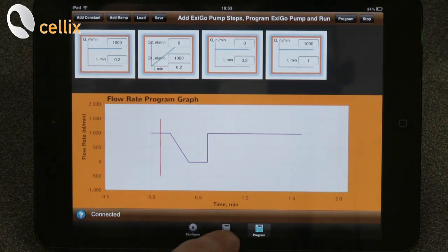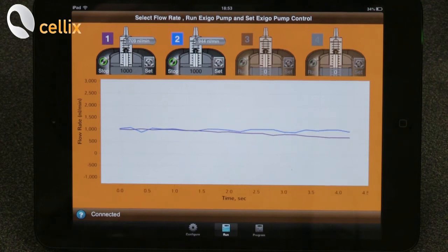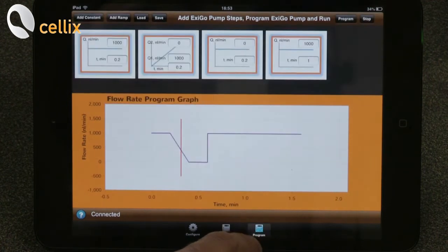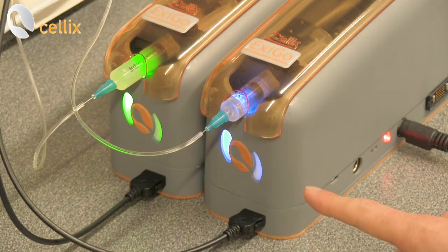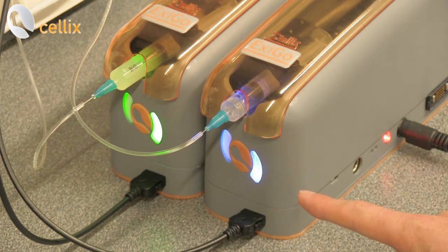We can come back to the view of the flow rates values clicking on the run button here. Or we can come back on the waveform selection mode here. As we can see the LED lights now they are blue. This indicates that the pump is executing a customized waveform perfusion mode.